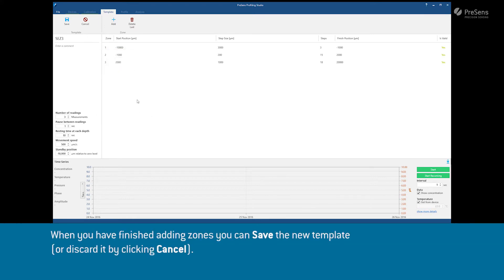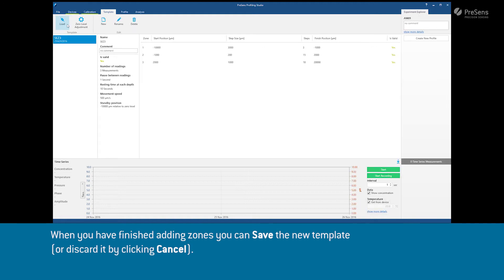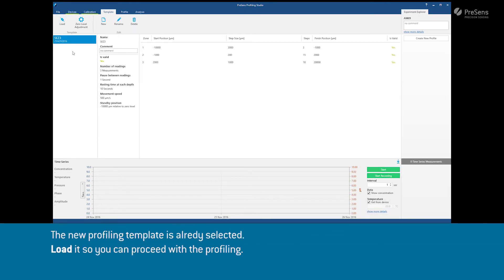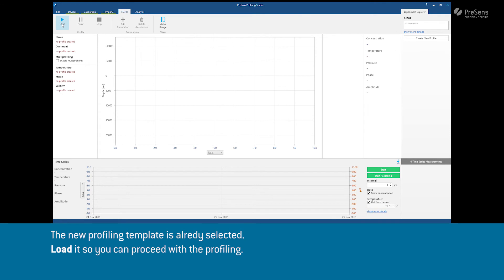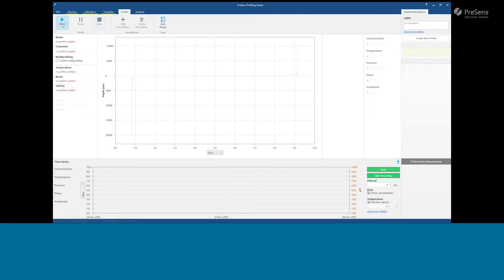When you have finished adding zones you can save the new template. The new profiling template is already selected. Load it so you can proceed with the profiling.